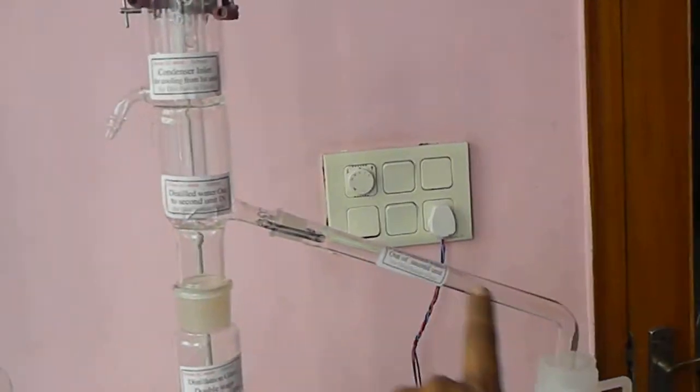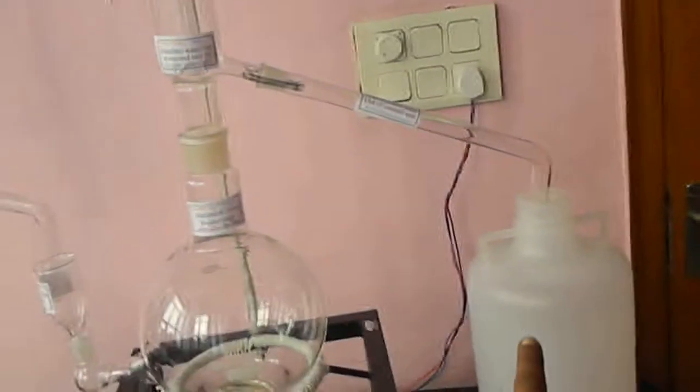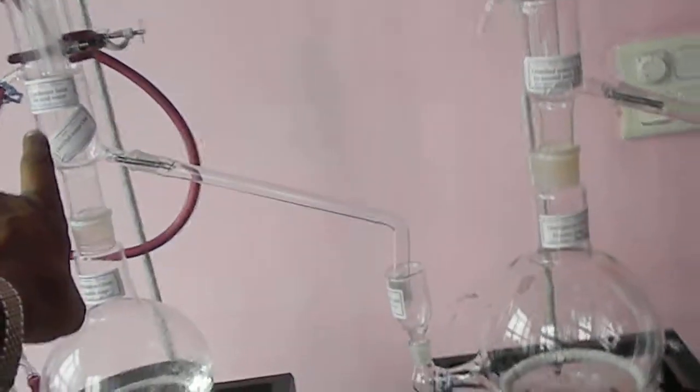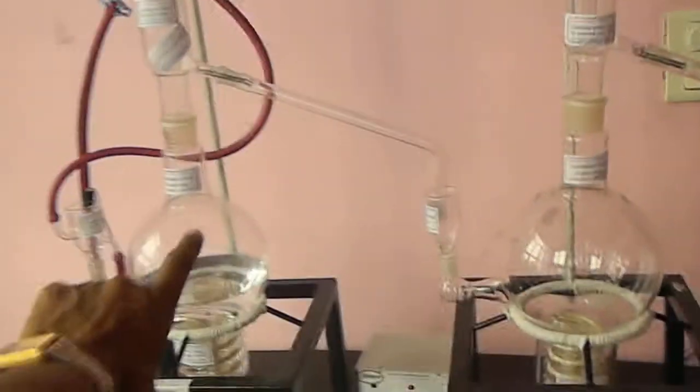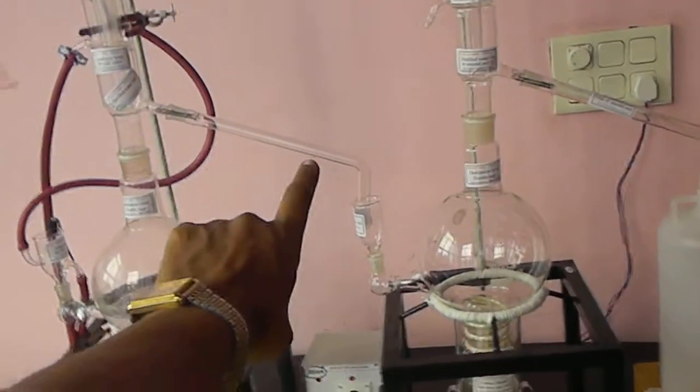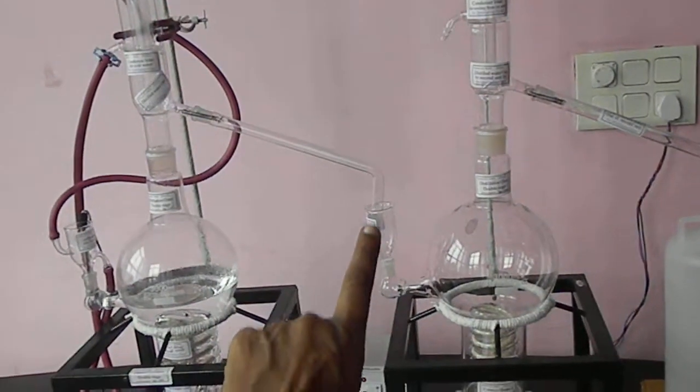You can collect either from this first section directly distilled water, or through the second section this water can be collected. But if you want to have a double distillation, first distill this water flask, the setup will distill it, and then the water will come out through this section.